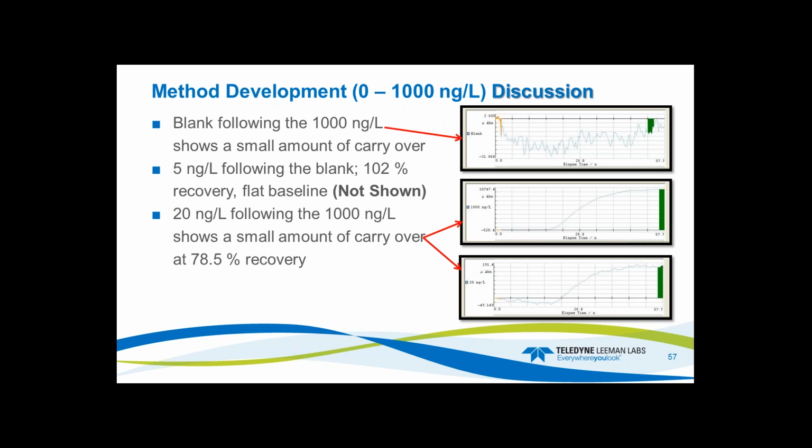So over here, you can see where it dips down below the line. So it's just going to measure from the blank correction spot and was still kind of coming down to baseline. So the true baseline is probably down in here. So maybe a little addition to the rinse time would correct that. The 20 would come in a little bit better.